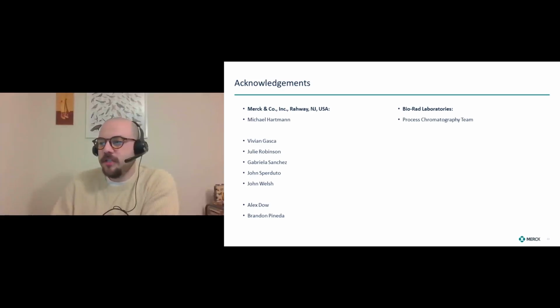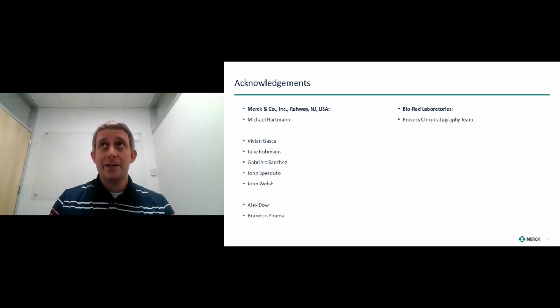So our first question is, how are you identifying your problematic HCP species? It's a good question. So initial identification used mass spec, either looking for abundance or looking for something that would enrich based on a certain type of activity. When we get to the high throughput screening itself, it can depend on the species.